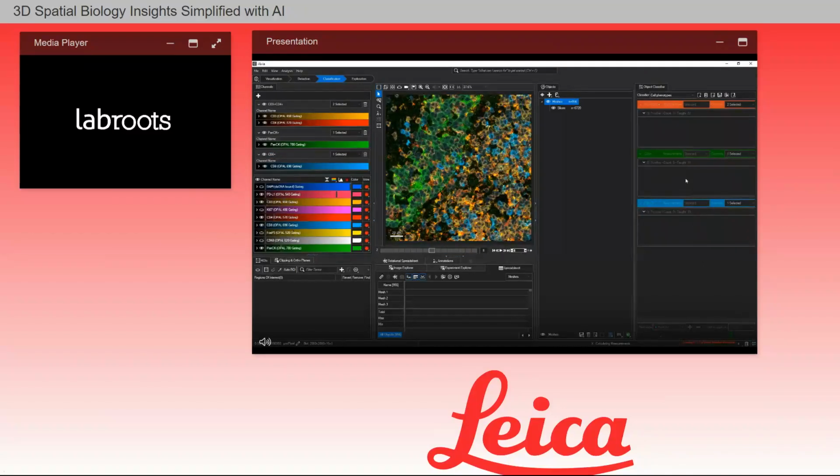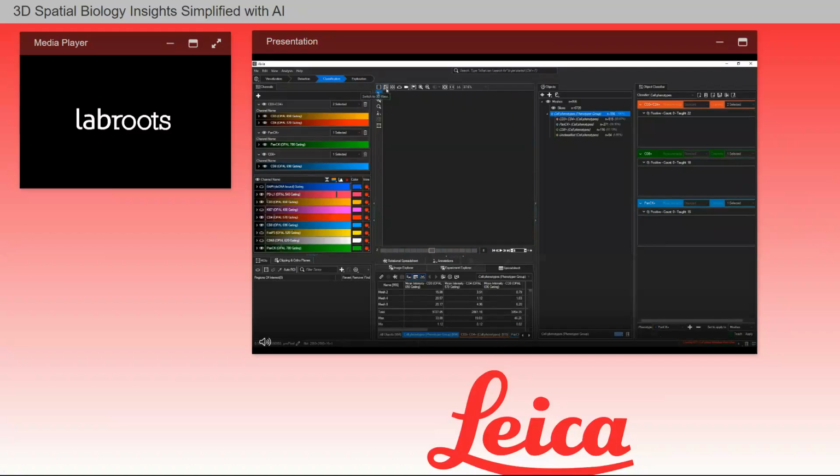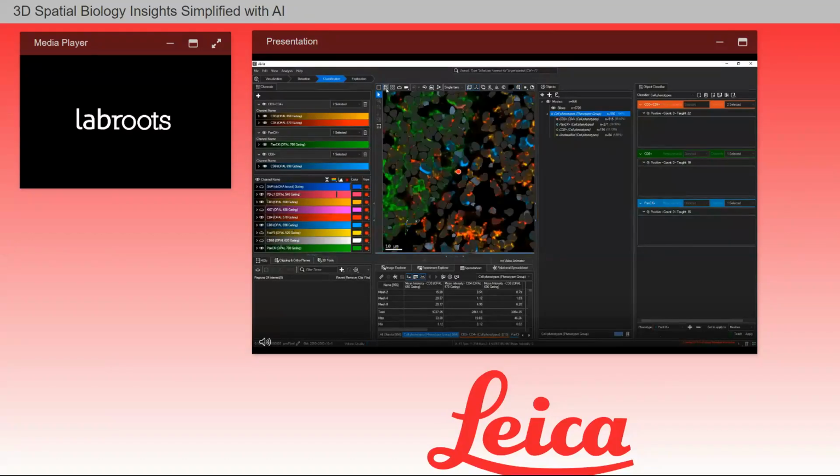While this is running, a quick review of the phenotyper. It is composed of multiple machine learning-based object classifiers. You can train the classifier by providing examples of each phenotype. The tool then uses random forests to identify the rules that are most likely to separate the different classes, and it iterates for each phenotype. Let us go into 3D again to see the phenotyper results on the 3D objects. I am going to turn off the orthoplane to show you the whole object.